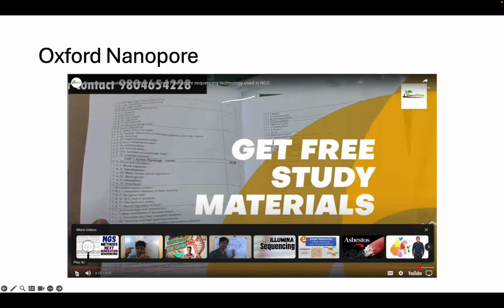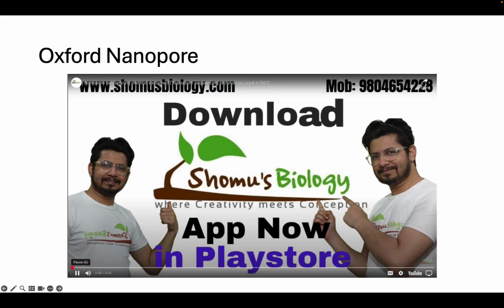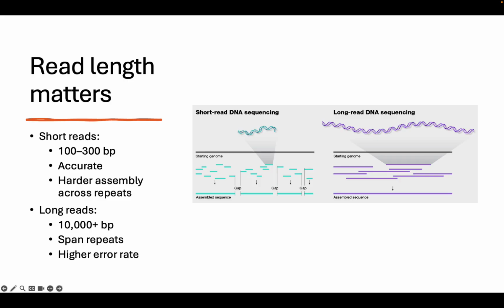So we do it because we want to, and we want to have that quality, and we need it to get as continuous as possible a eukaryotic genome. But it is out of reach for a lot of people. And of course, that read length itself really matters. So short reads, anywhere from 100 to 300 base pairs, are very, very accurate.